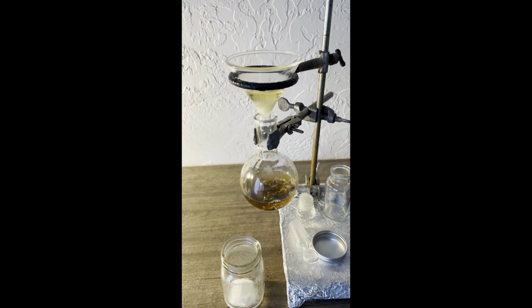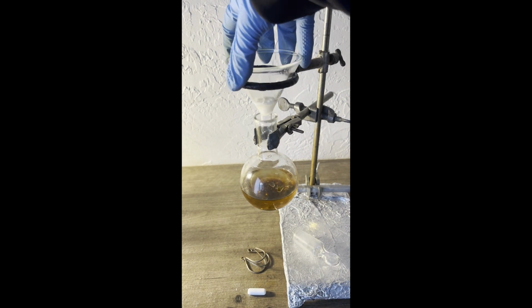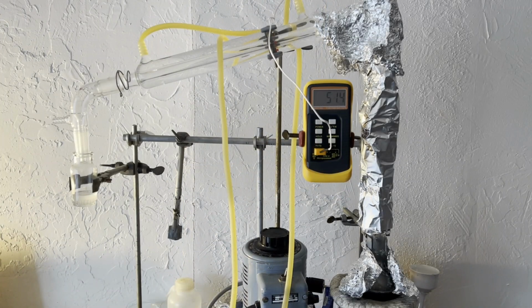Afterwards, it was filtered, layers were separated, the organic layer was dried with magnesium sulfate, and it was filtered directly into what was left in the flask from distilling the iron-sulfur catalyzed chlorination mixture. So I washed all the containers containing anything chlorinated out with some DCM and filtered that into the same flask. I then fractionally distilled the whole mixture with a proper setup.